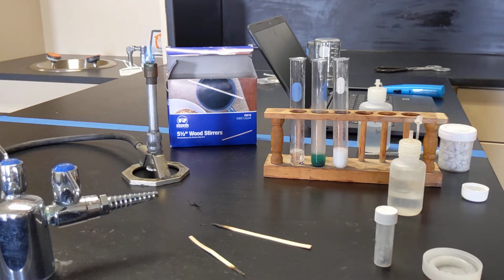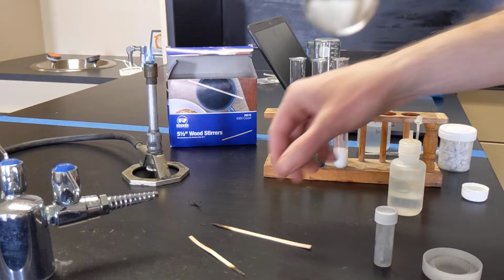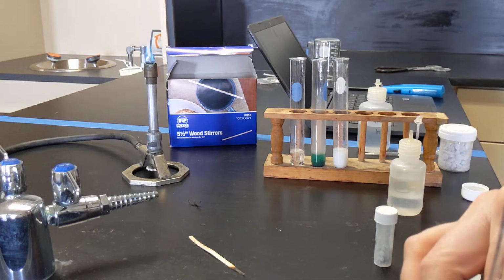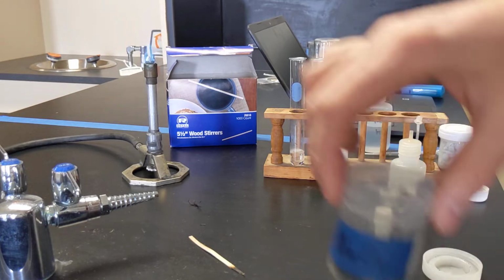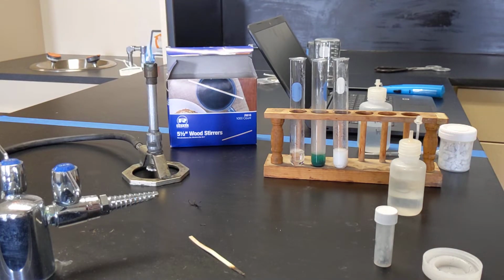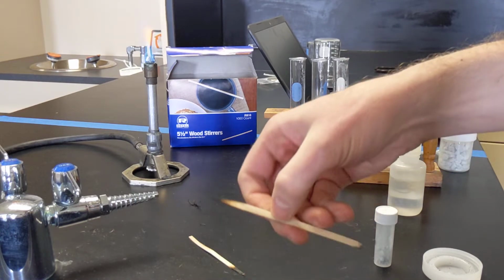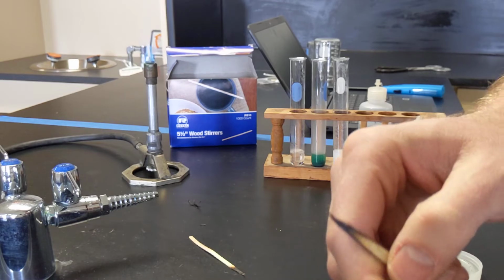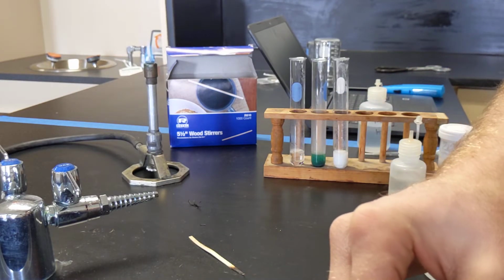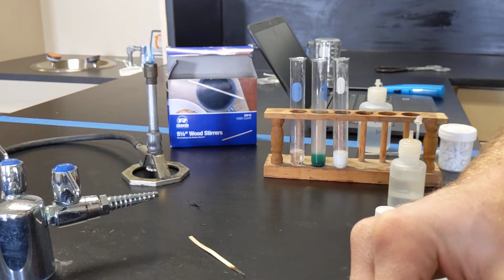Its chemical name is manganese 4 oxide. So I'm going to take just a little baby bit of this stuff. It's a fine black powder. This is not involved in the chemical reaction. It is a catalyst. So hydrogen peroxide does decompose all by itself without any other chemicals reacting with it. Please remember the definition of a decomposition reaction. You only have one reactant and it splits apart. So there is no other chemical needed for this reaction to happen.